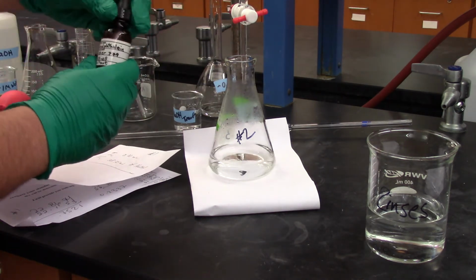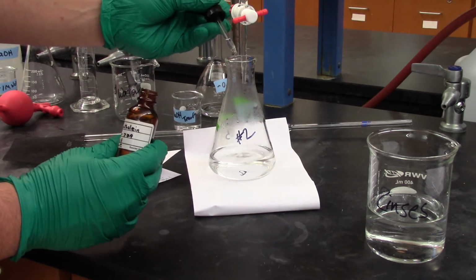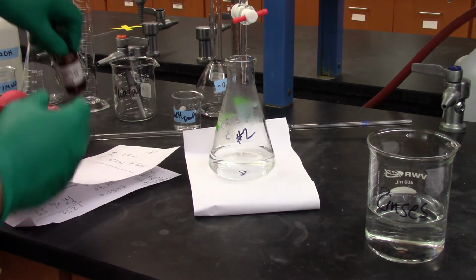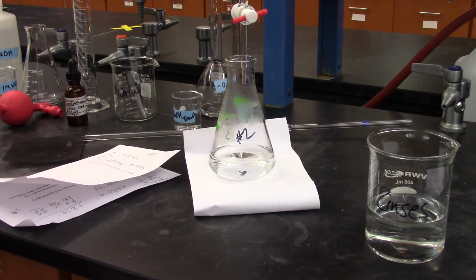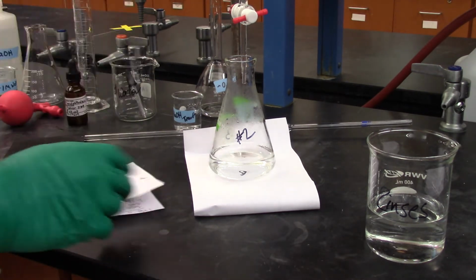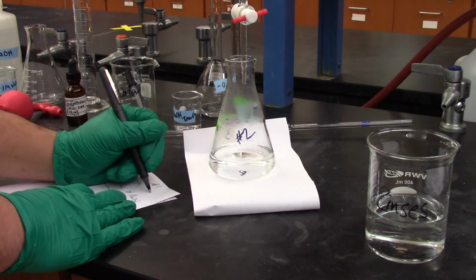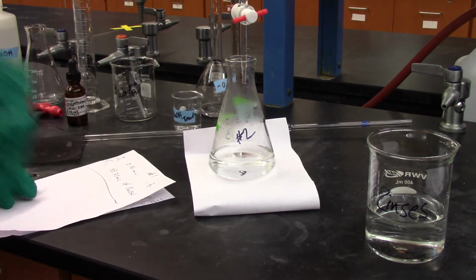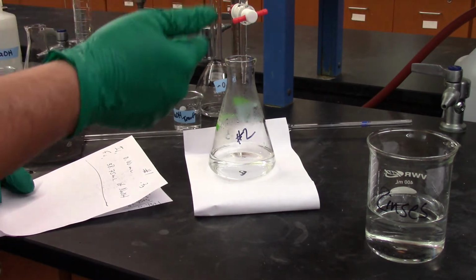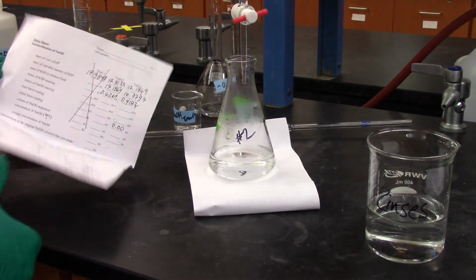Remember, put in the phenolphthalein, because your solution will never change color at the end point of the reaction. So I'm on number 2. For number 1, I actually had a little bit more than what I should have used for the directions. For that one, I had about 0.7 grams, but no matter what, you can still do the reaction. If you have too much, you might not be able to use the whole total solution in your burette. So that's why we have a range for you.